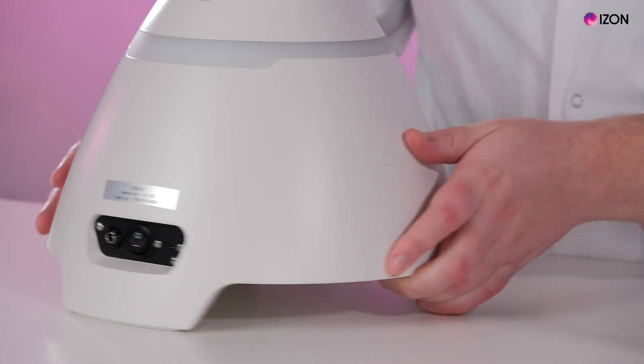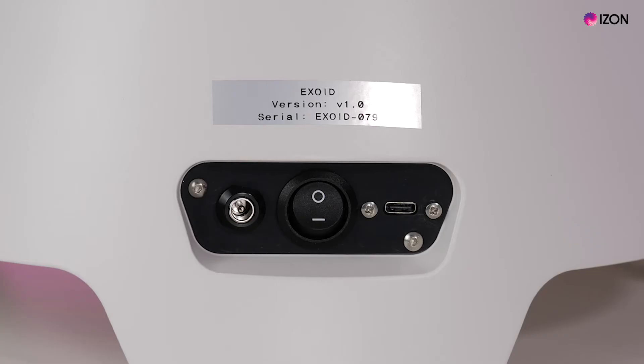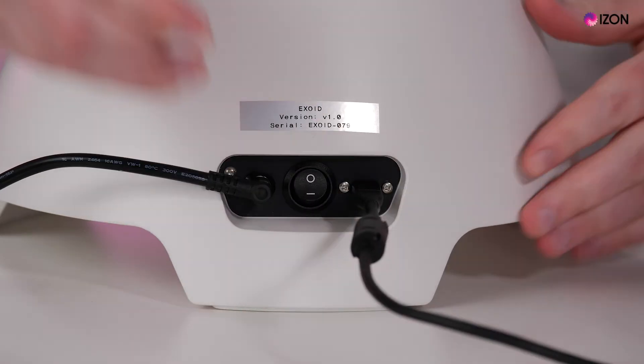After you have removed the Exoid from the packaging, check that there is a power cable and a USB-C cable included. Check that the power switch on the Exoid is in the off position. Then plug the power cable into the power socket and the USB-C into the USB socket.